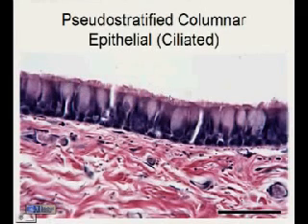In the respiratory tract, there's a layer of mucus that's over this ciliated structure. The mucus traps particulate matter, and in a wave-like motion, the cilia actually help to throw the mucus outside the respiratory tract. So a person would either cough it up as phlegm or swallow it where it would enter the digestive tract, and whatever the debris or bacteria or viruses would be killed by the digestive enzymes in the stomach. So this is the cilia.